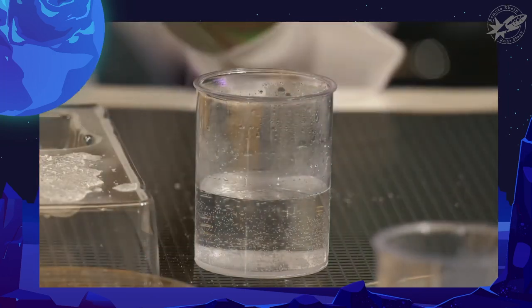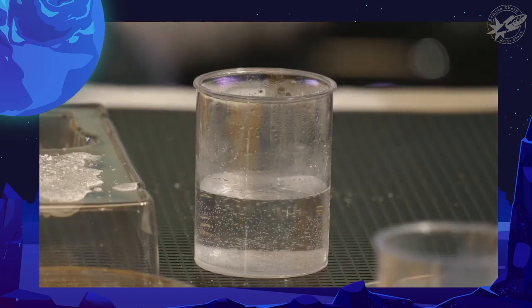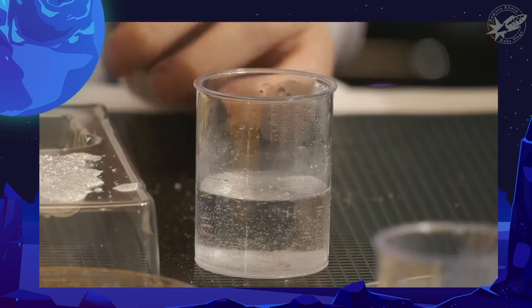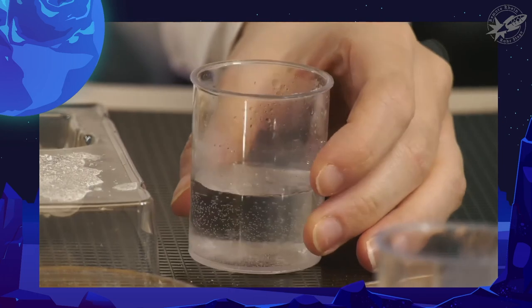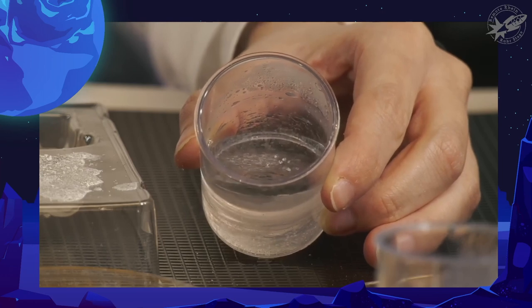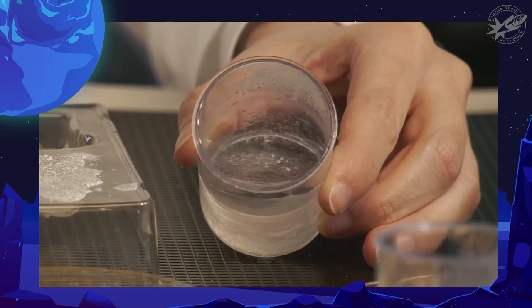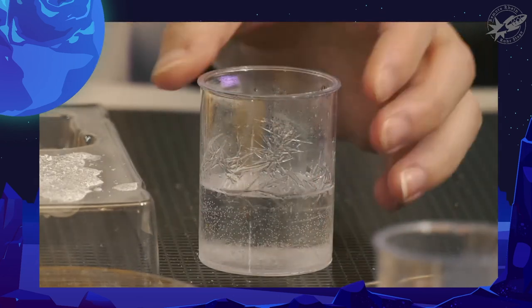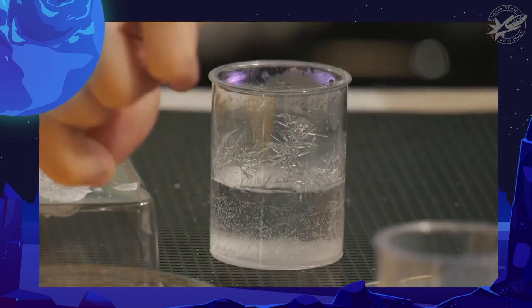The non-liquid crystal I will touch with my hands because it's easily removed, similar to sugar. You can see that it immediately starts to crystallize. The issue is that I'll try to turn it down slightly. You can see that something is swimming in here. There are these crystalline structures, which you can see.